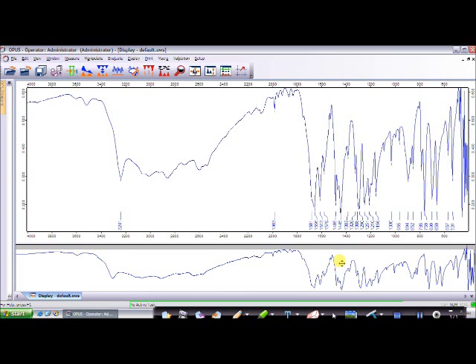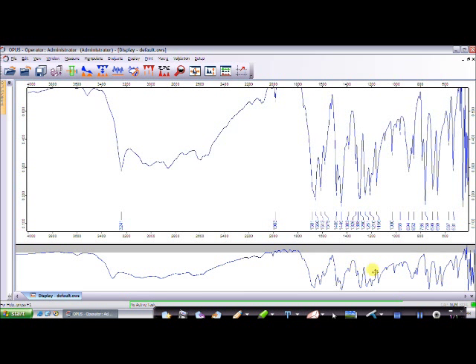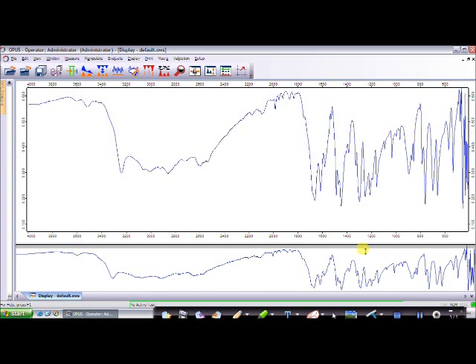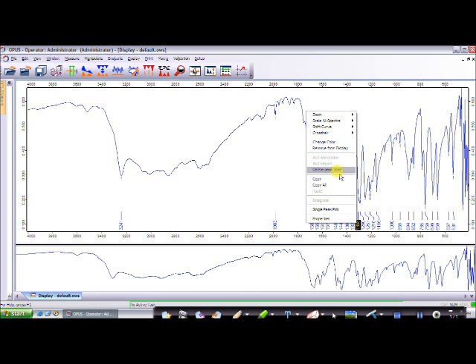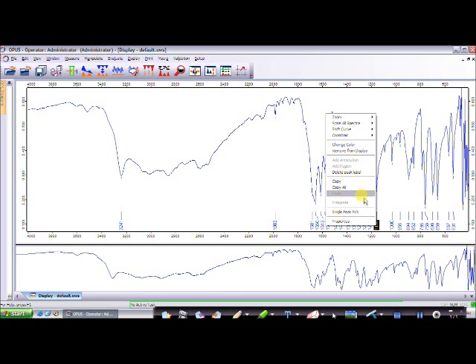So now you're just going to place the mouse cursor and drag down the bottom, okay, so that you have a clear projection of your whole screen. Adjust the view of the spectrum that you want to be printed on the paper that you're going to submit. Now you see that on the right hand side of this IR spectrum, there are just too many peaks that you do not want to appear.